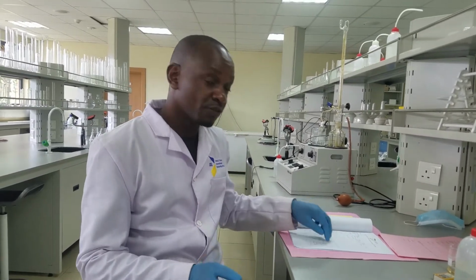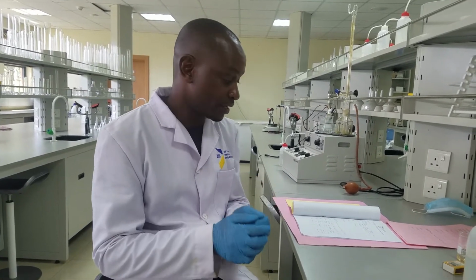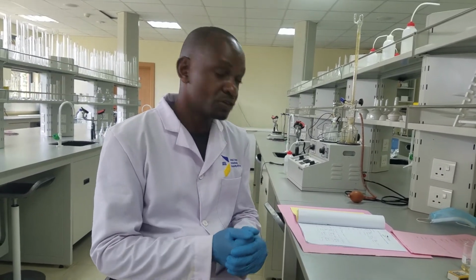Okay. Now we have done a few tests, as you can see, but several of these tests, the ones we have not done, you'll see when you come back, to identify hydrocarbons. And so I want to invite my colleague Eugene to carry out the second part of this experiment, which is to identify the aldehydes, ketones, and acid anhydrides. Thank you.